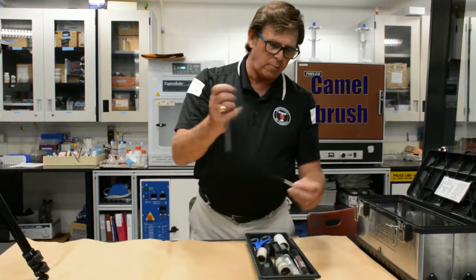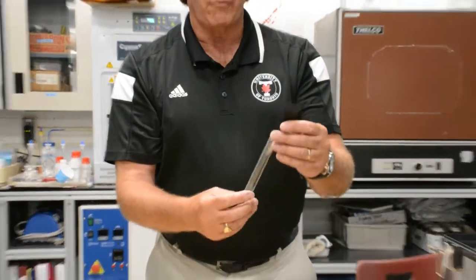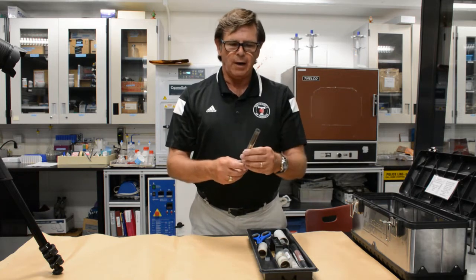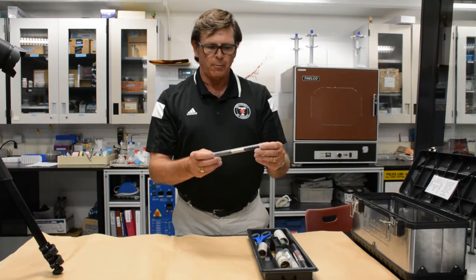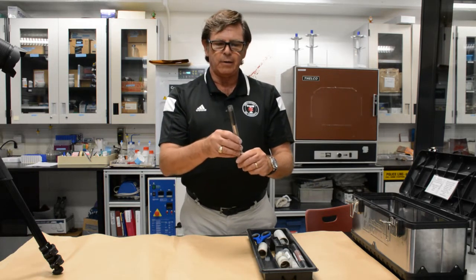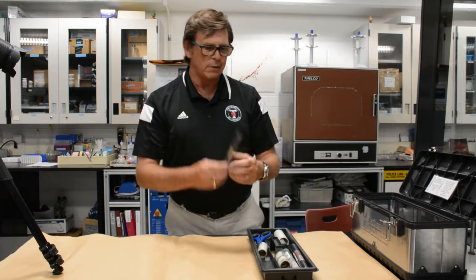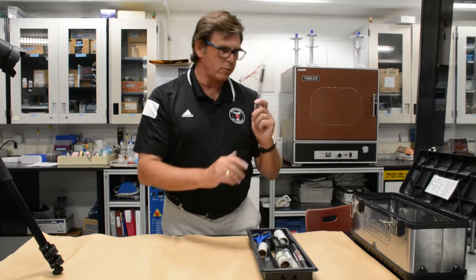The camel or squirrel hair brush is this tool here. It is primarily used for cleaning out excessive dirt or fingerprint powder within the furrow areas in between the ridges. So cleaning up excess powder and other things that may interfere with the overall quality of the developed fingerprint. These were used as a primary fingerprint brush in earlier generations, but because of the quantity of powder they could hold, you had to keep recharging the brush, given its size and the type of bristles it had. So we moved away from these to more of a fiberglass filament, which we'll talk about momentarily.